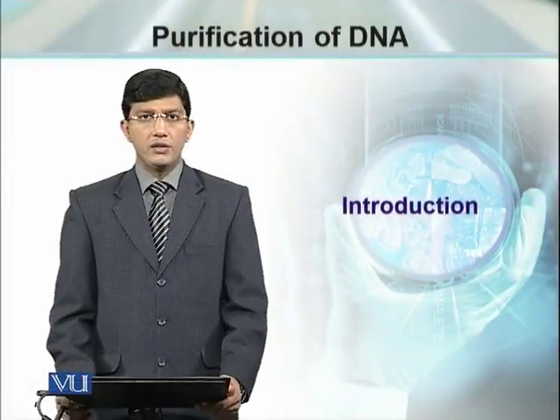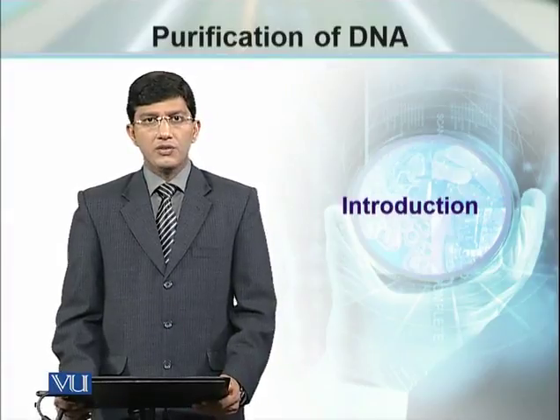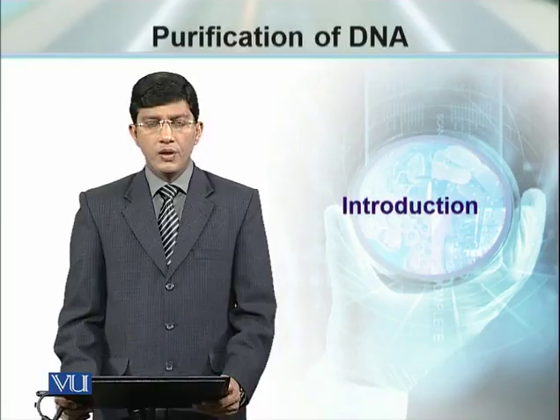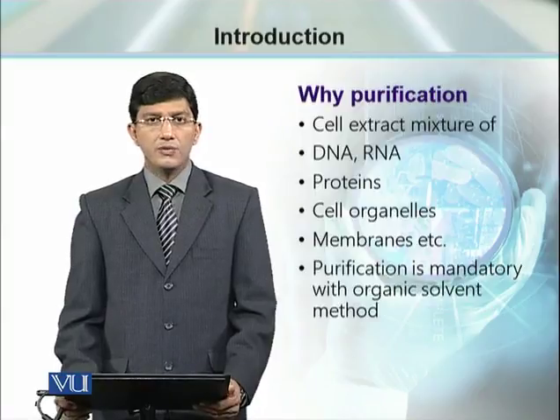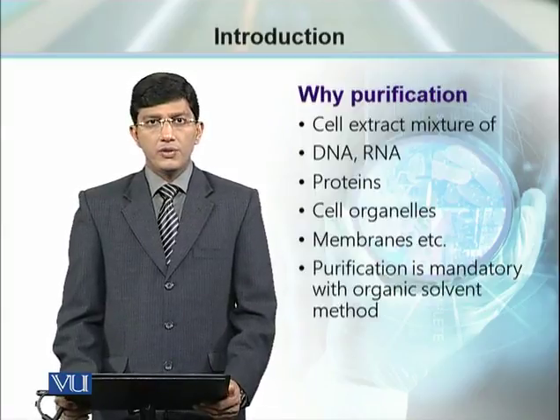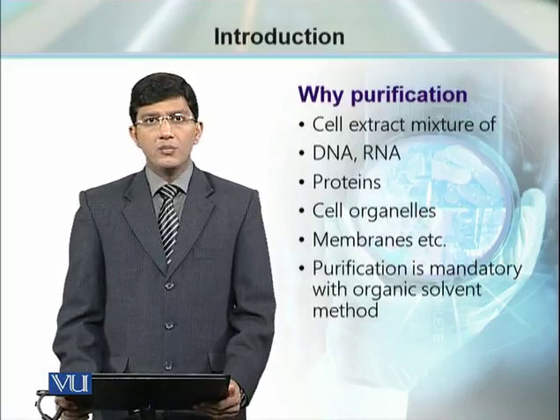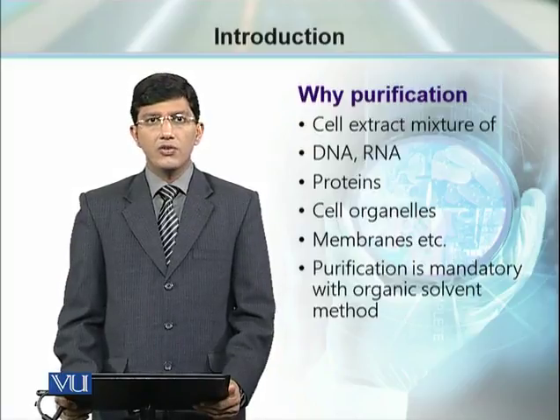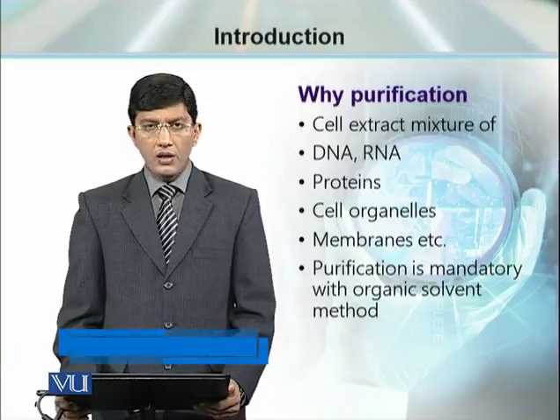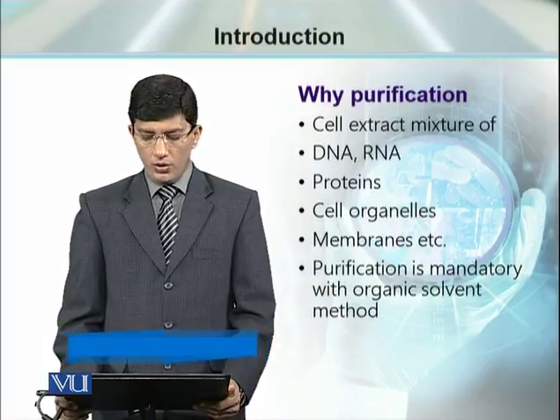Whenever we start working with the isolation of the DNA, the main concern is about its purification. As the DNA has to be isolated from the cells after digesting or after damaging the cells. As a result of this damage, there are a number of unwanted materials, particles, and cell organelles which come in the solution. So we have to purify, or we have to take our DNA out of those unwanted molecules.